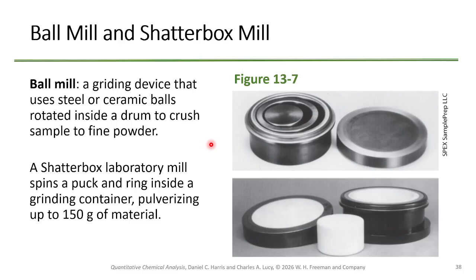This right here is a ball mill. It's actually a grinding device that uses steel or ceramic balls that rotate inside a drum to crush sample to fine powders. It's actually very common use in industry. You'd see this a lot in industry.